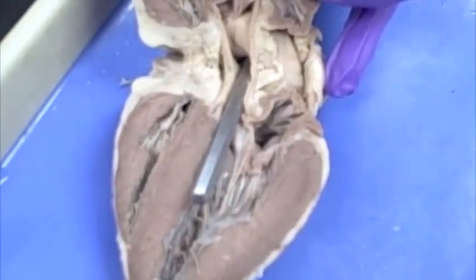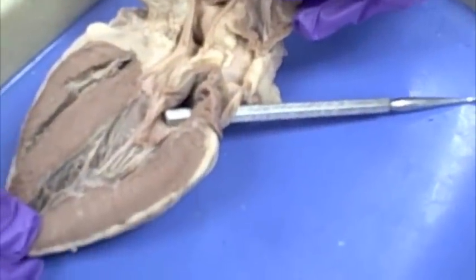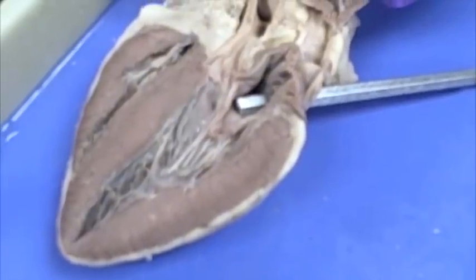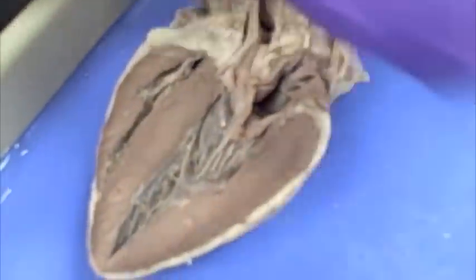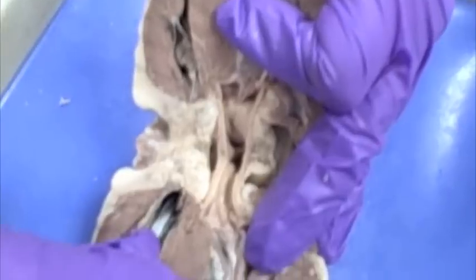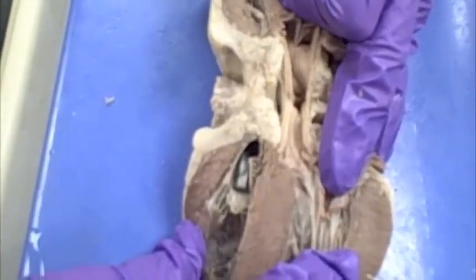You have to know the pathway of blood flow through the heart in order to answer questions like that. Another example: if the probe went through this direction here, you would look and say this is the left side of the heart because it's thicker. This is the left atrium, and blood is brought into the left atrium through the pulmonary veins. For the vena cava — the probe is passing through the right atrium, and so the blood vessel the probe is passing through would be the vena cava.